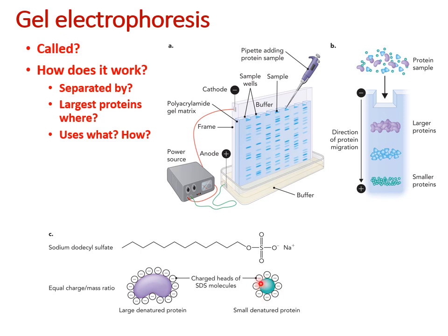That's important because when you load them on the gel, you're putting them in the wells that are near the cathode, which is the negative side. Because you have now coated them in a negative charge, it's going to make them want to repel away from this top portion of the gel down toward the positive side, the anode. Okay, and so they will want to run toward that positive charge because they're currently at a negative charge.